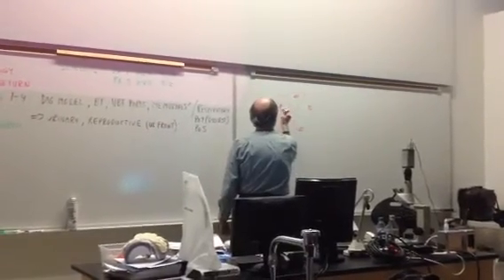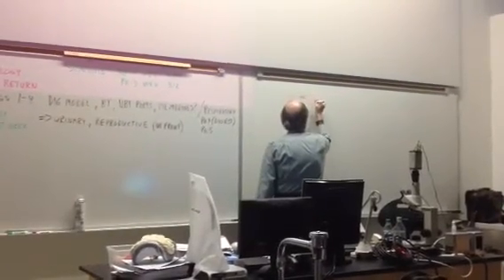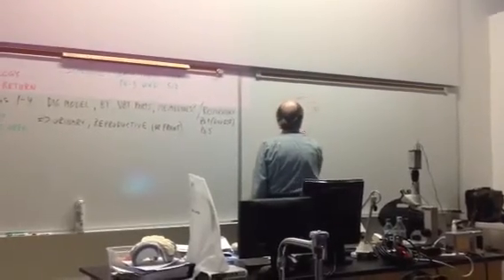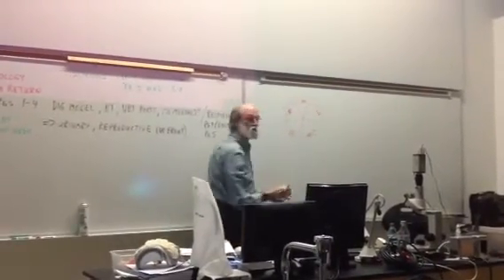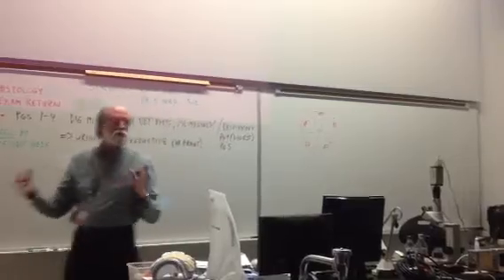And usually it's darker staining out here because there's a lot of ribosomes and rough ER, because you're making proteins. You're making the digestive proteins that are going to go into your small intestine. So it looks dark to the outside, and it looks light towards the center. And that ductule is so small, and usually it collapses, so we really don't see an opening.